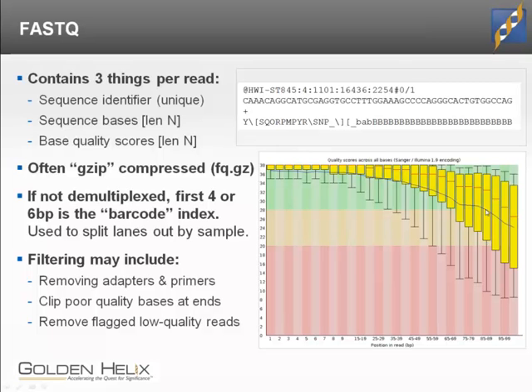We've worked with people doing RNA-seq who say, I had 100 base pair reads. Why does everything look like it's been trimmed to 75? And we have to explain, well, if you look at this chart, you can see quite clearly those last several bases did not perform very well. Sometimes they are good. That's why we see the whiskers on this bar chart coming up pretty high, but you won't always get that.